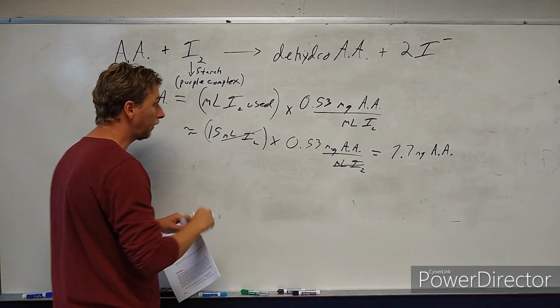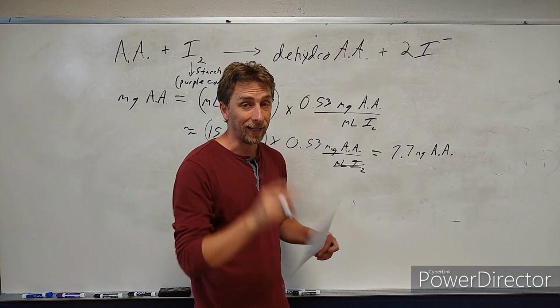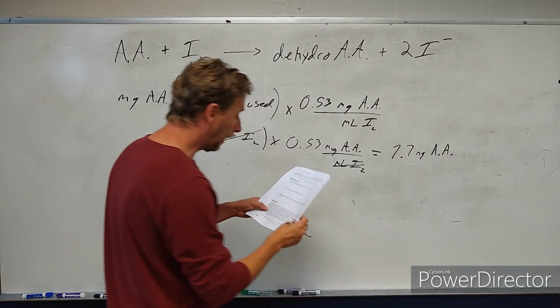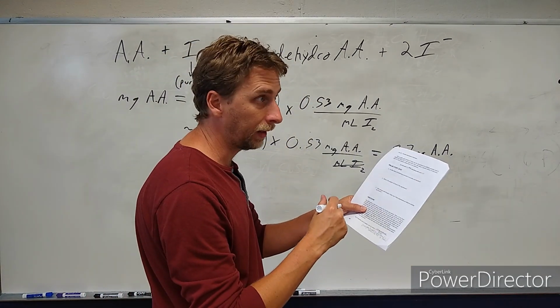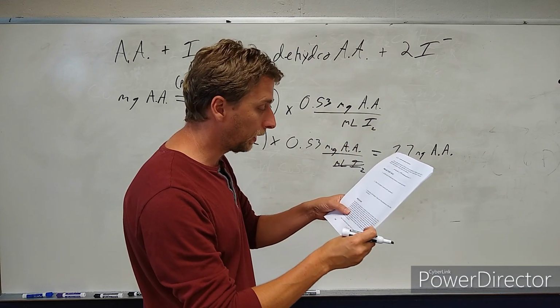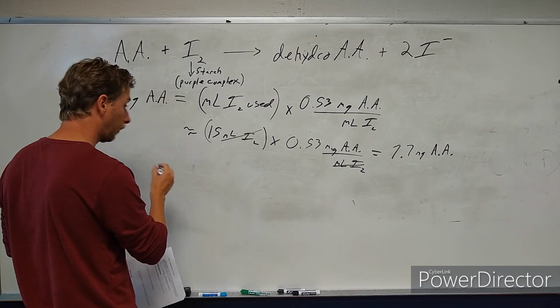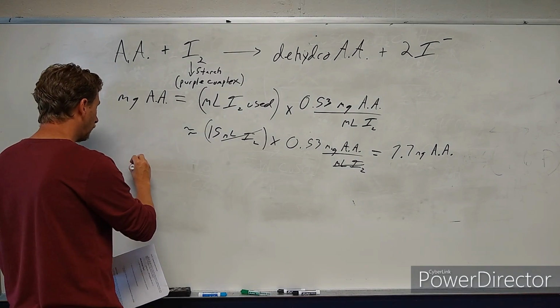And so we start with the concentration of the iodine. That's the key that you need. So on the procedure here and in the lab, we are going to use the concentration of the iodine. It's 0.003 moles per liter.